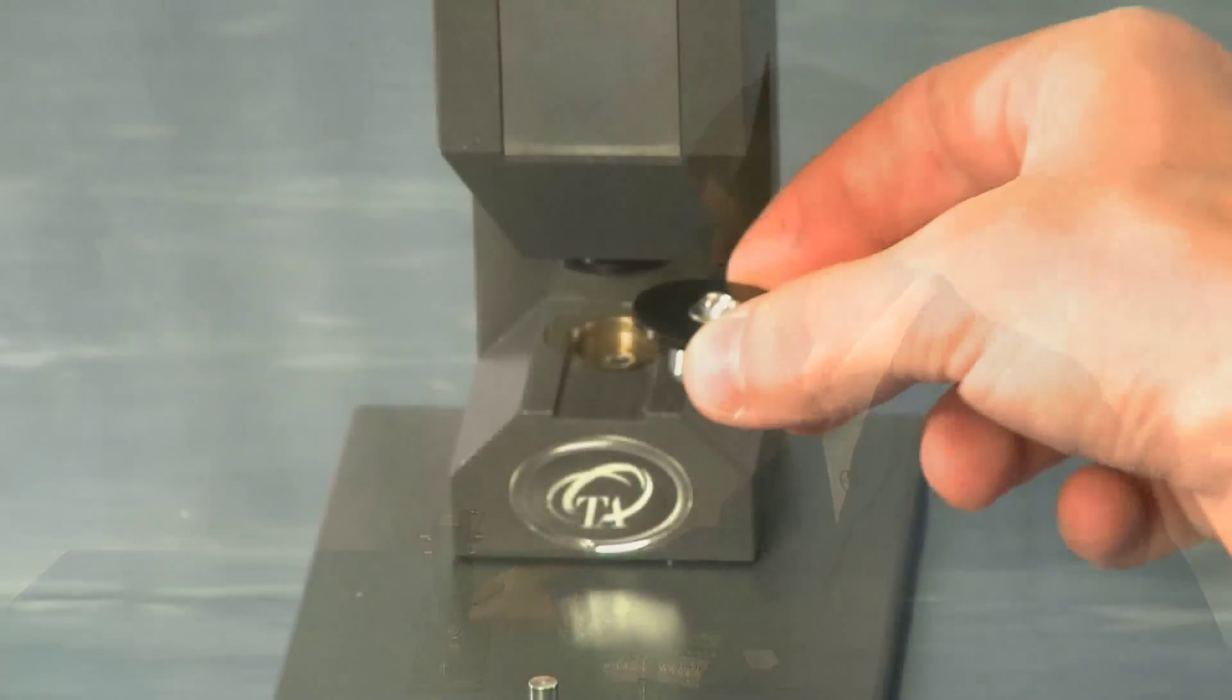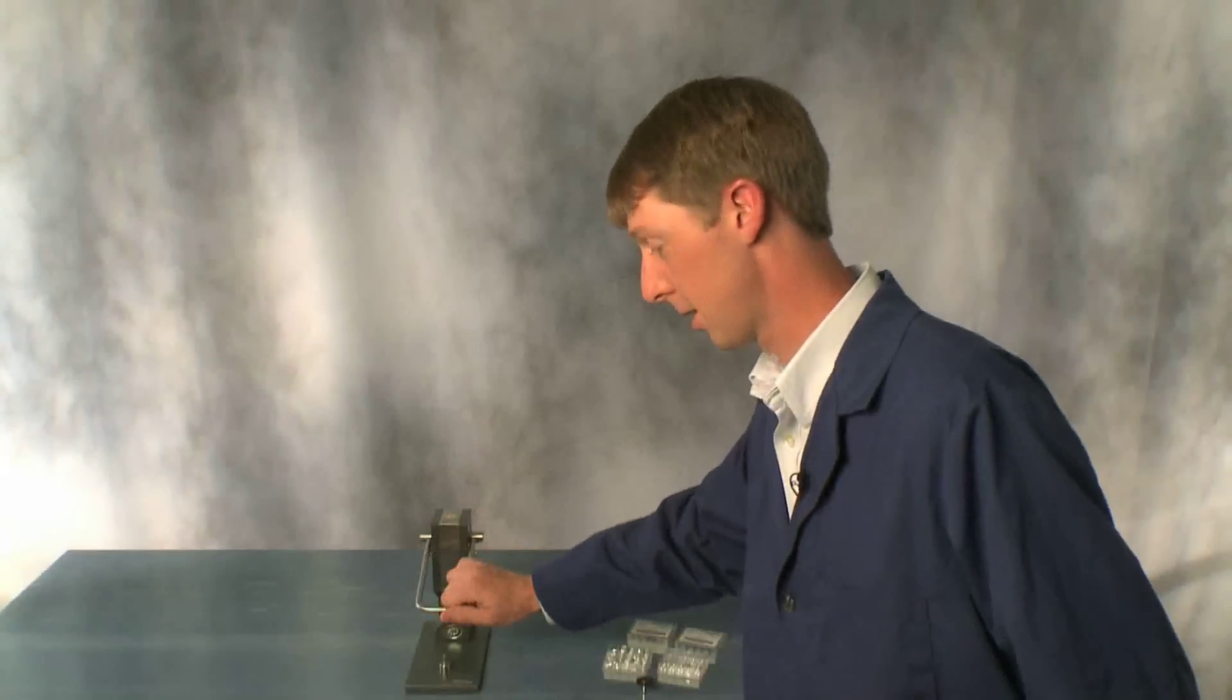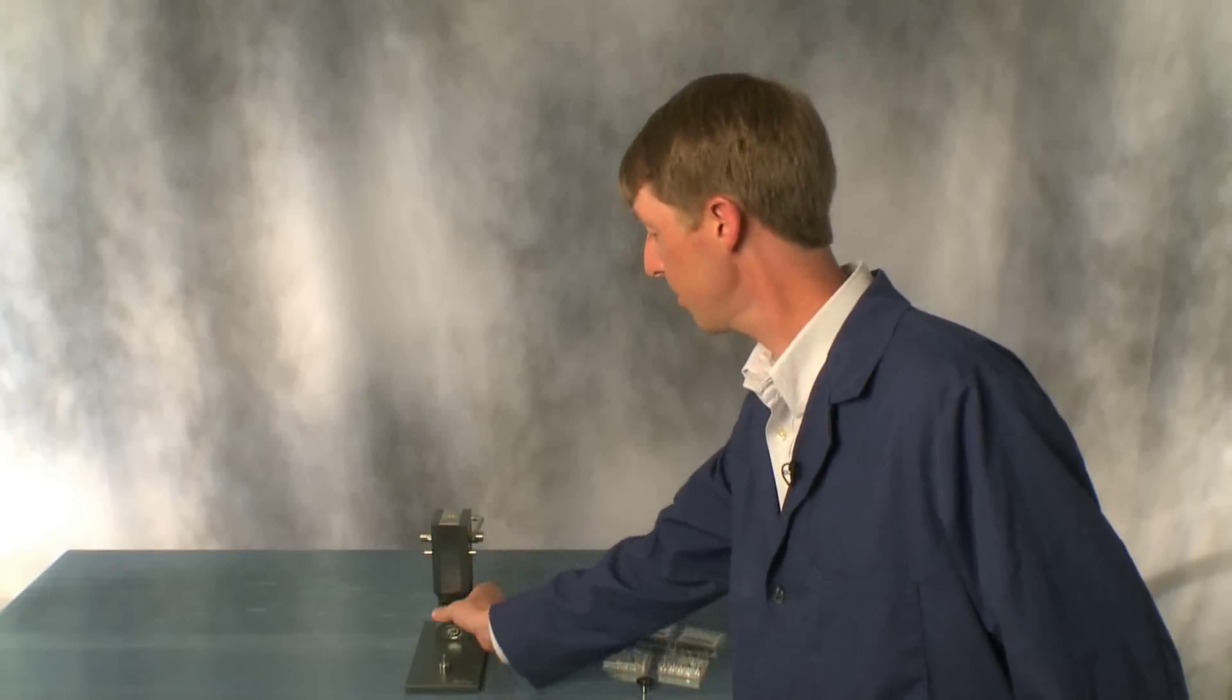Once you place that into the pan, put the lower die in the press, pull the handle down, pull the lower die out, and you're ready to run experiments.